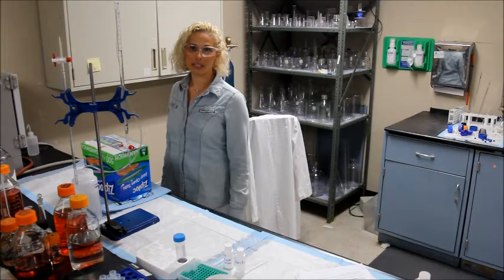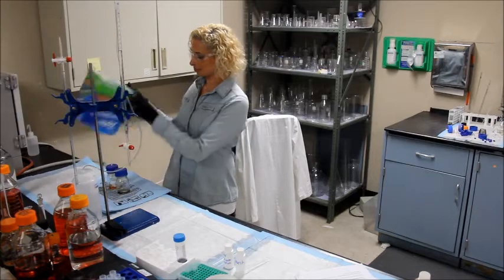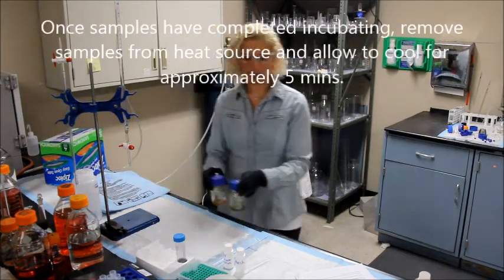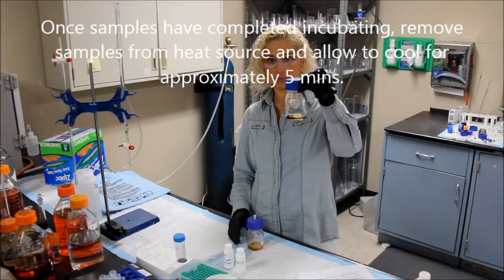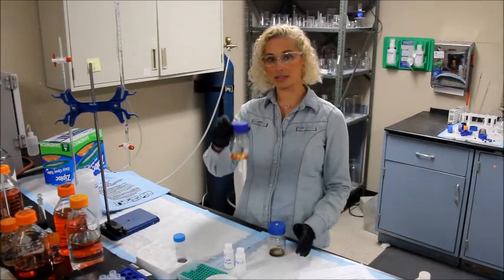After the incubation is complete, remove all the reaction bottles from the heat source and allow the samples to cool for about 5 minutes. When the samples are complete, you will see that the orange oxidant is now brownish green, and the blank sample is still orange.